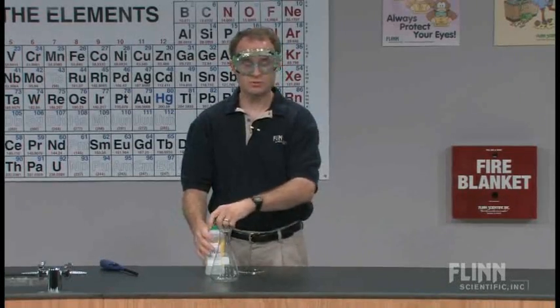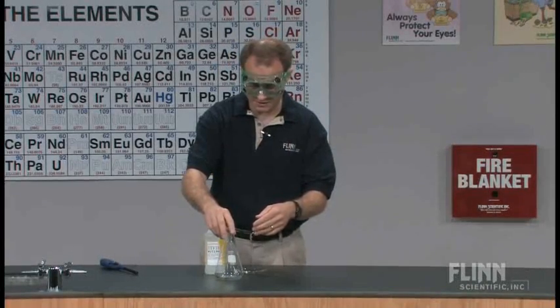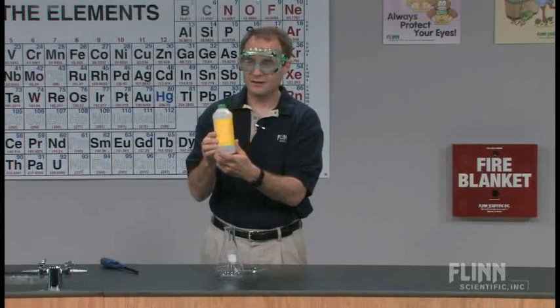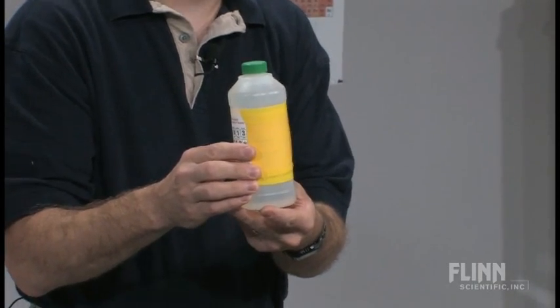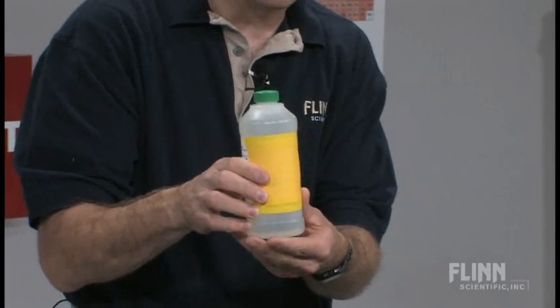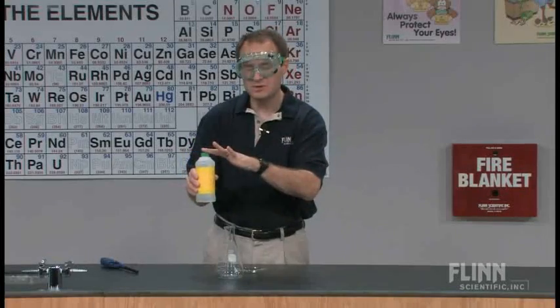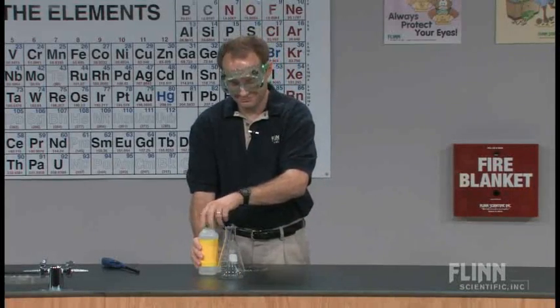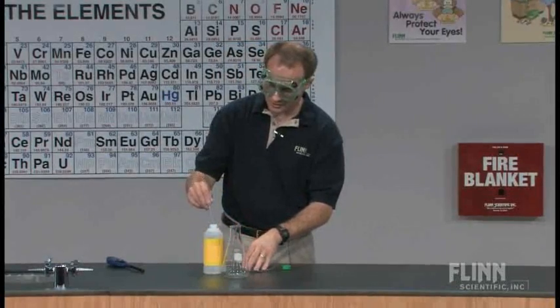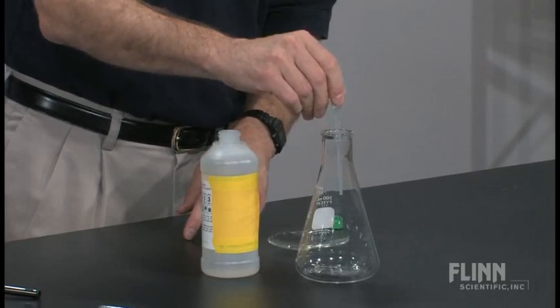Before the students would arrive, I would take an empty Erlenmeyer flask such as this. I'll take a mystery chemical such as this — it's a mystery to them, and I've tried to cover anything that would give them an advantage in terms of knowing what it is. Obviously a teacher should know what it is. What we do is add one full squirt of this chemical into the bottom.